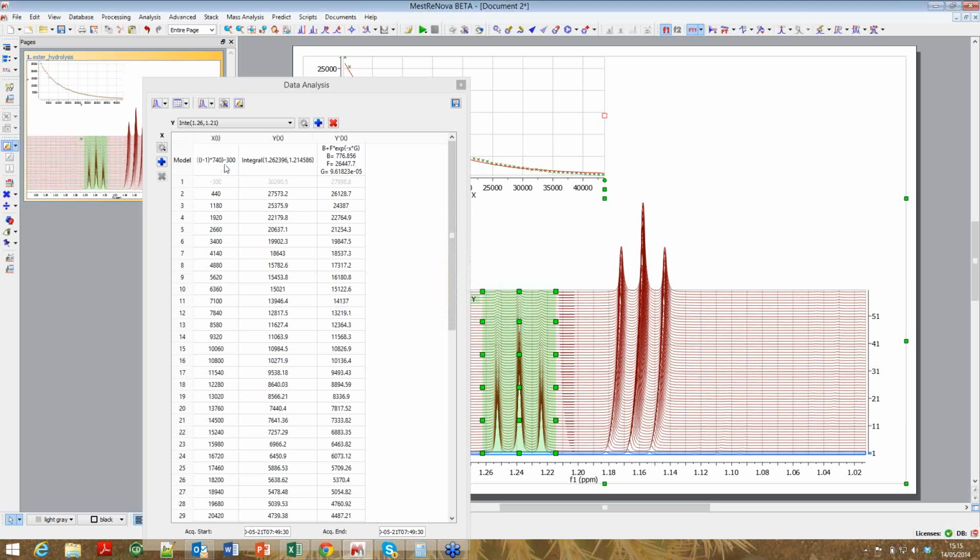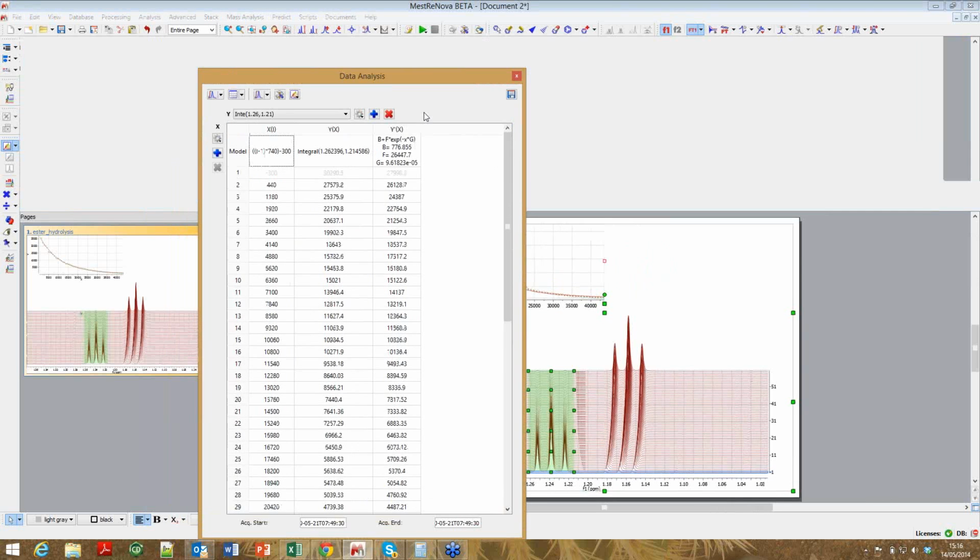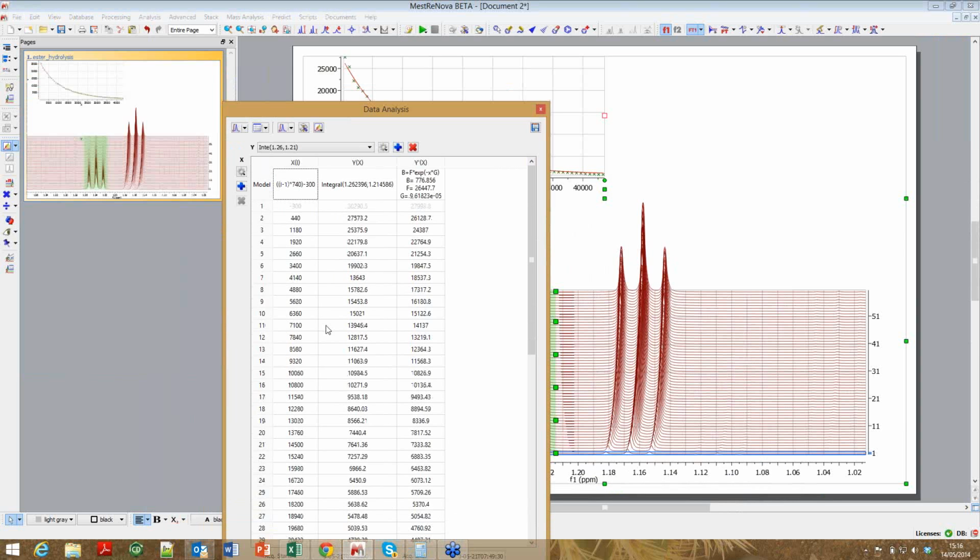Okay, well, enough playing with that. You see how that goes, basically. The second way of playing around with the time indices is to import them. So let's say that we've gone ahead and created a nice spreadsheet with the data.